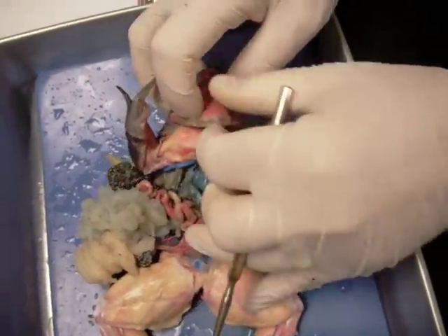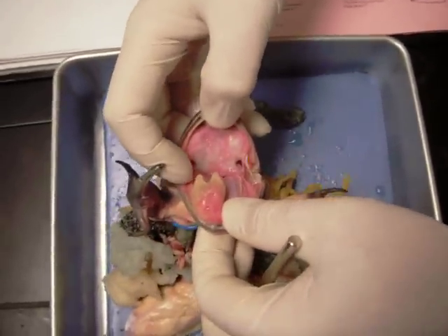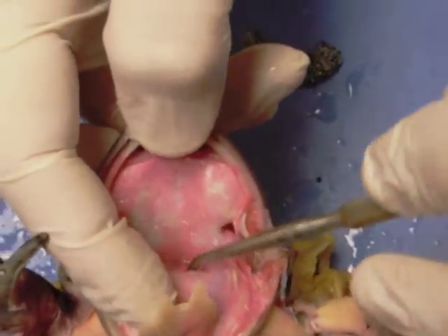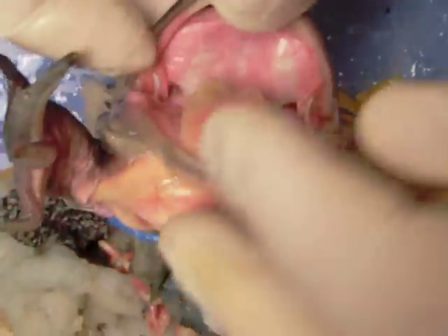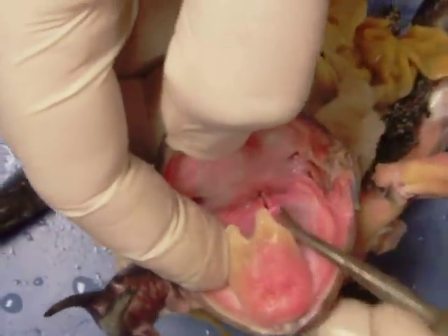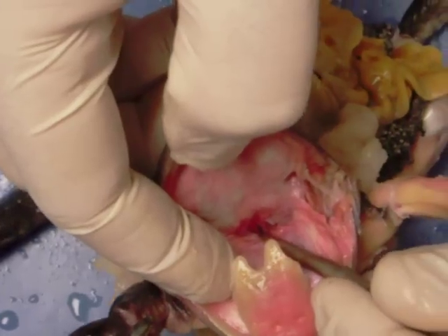On this particular specimen the mouth has been dissected out properly. Here we have the tongue. Following back into the back area here, there's a slit — there it is — that is the glottis, the opening to the trachea. This area in the back of the throat is known as the pharynx, and if you pull this down you can see that's the esophagus down in there.